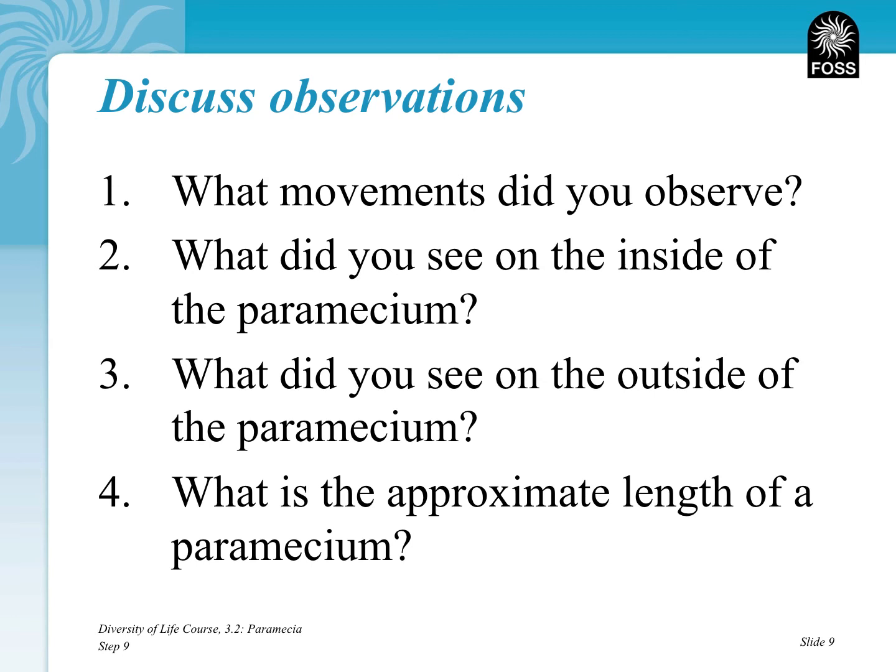What were some of the movements that you might have seen with the paramecium? Well, I know I saw that they're moving through the environment, they're bumping into things, they're turning around, maybe moving in circles. A couple of them bumped into each other. Some of them move at different speeds than the other ones as well. So those are the kinds of things that you're going to see from paramecium in their water.